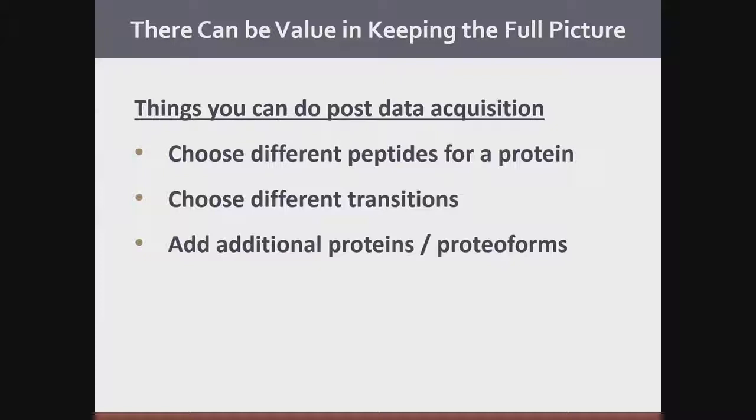We don't know much about proteoforms, but people are collecting more and more data about them, and the quality of the data is getting better and better. People are finding new alternative splice forms, and we'll be able to go back and interrogate those things as new data becomes available.